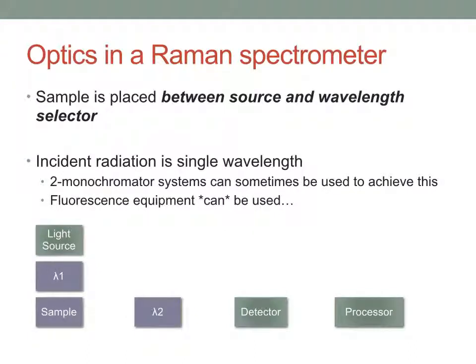So this is the second recording for this lecture on infrared and Raman spectrometry. This here is just a quick sketch of my fluorimeter. I can use fluorescence equipment to measure Raman. I've said that because when I was talking about fluorescence, I said that I used Raman to calibrate the emission wavelength for my detector.